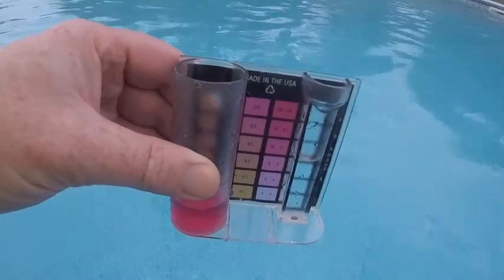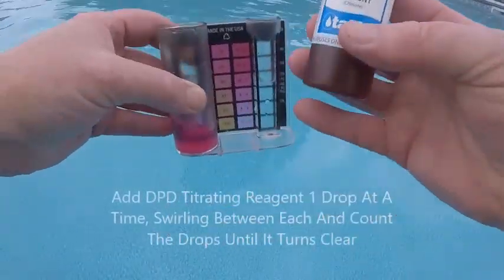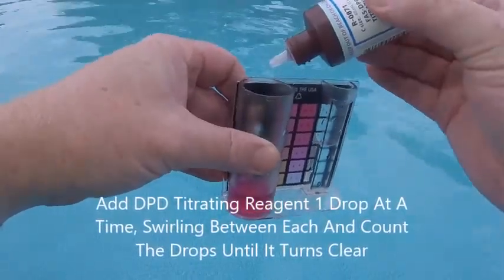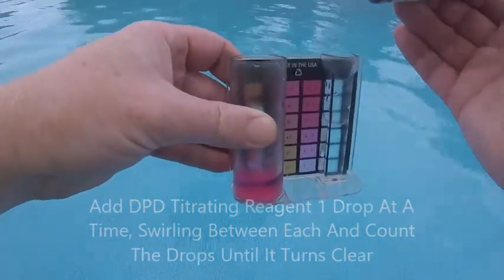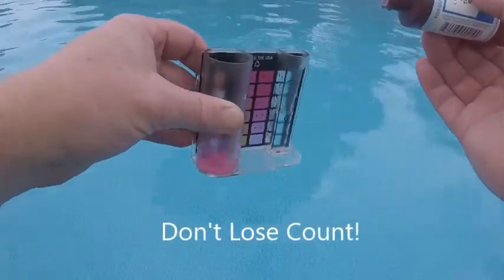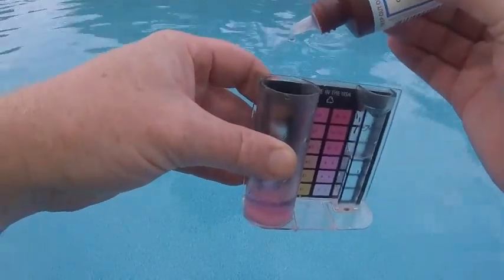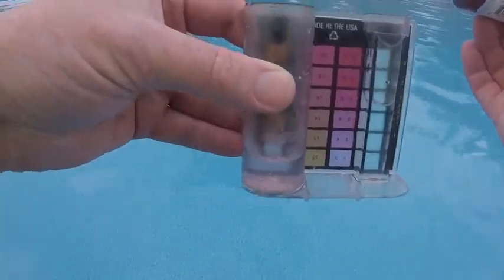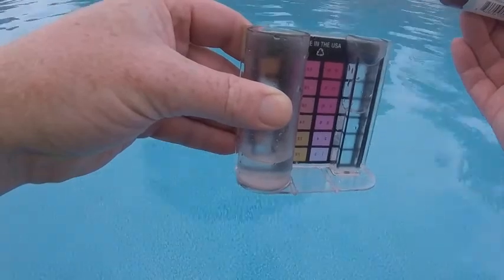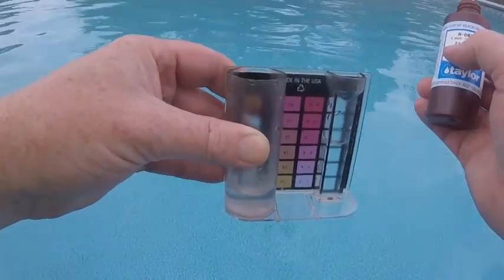Then you're going to get your DPD titrating reagent. All we're going to do is add 1 drop and swirl until it turns clear, then 2 drops, swirl, 3 drops, swirl, 4 drops, swirl, 5 drops, swirl. I think 6 would get it — 6 drops. And there you go, it's clear. Actually 7, and it's real clear. We could call that 6 and a half, or 7, as it went almost clear at 6 and completely clear at 7.